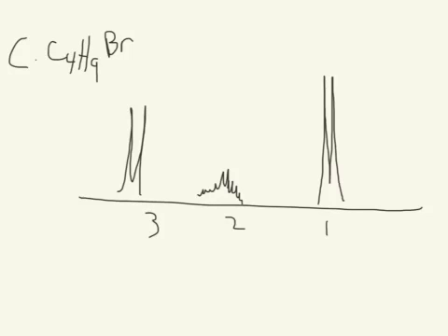Our last isomer. The interesting thing going on here is there's a whole lot of hydrogens in this signal, so that indicates we have equivalent hydrogens. Since it's at 1 or more upfield, it's most likely CH3s. So we've got two CH3s, and they're equivalent. And we know what they're bonded to. They're bonded to only one hydrogen because there's only two peaks.